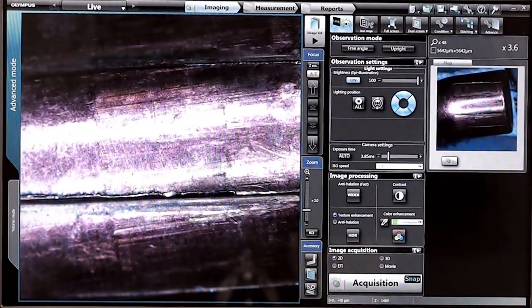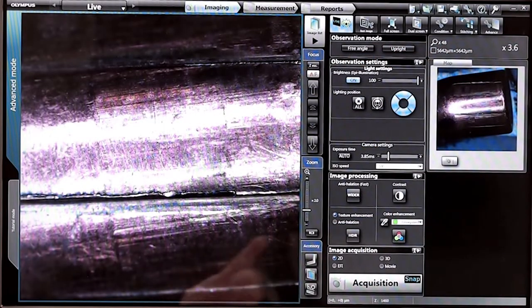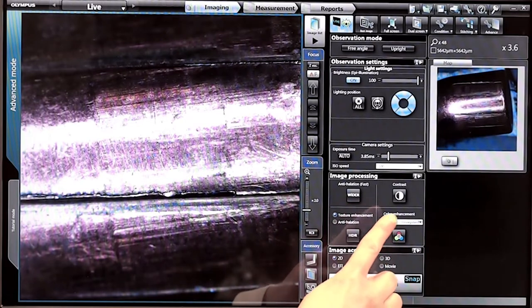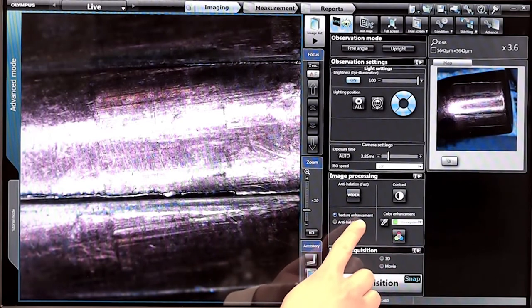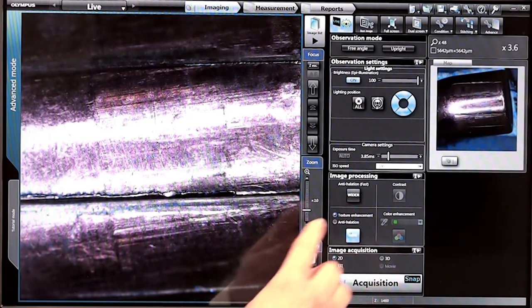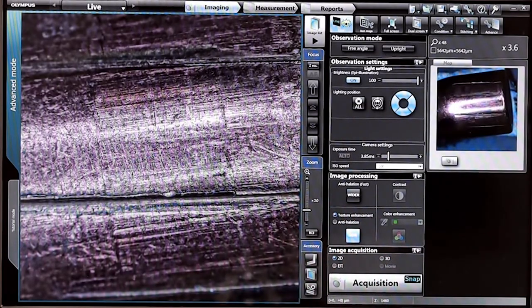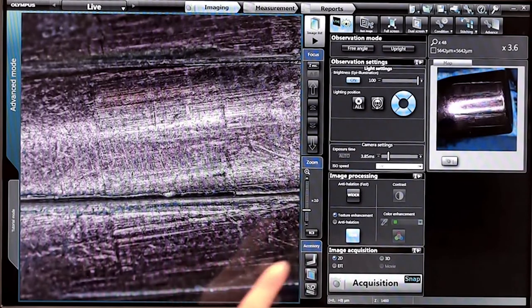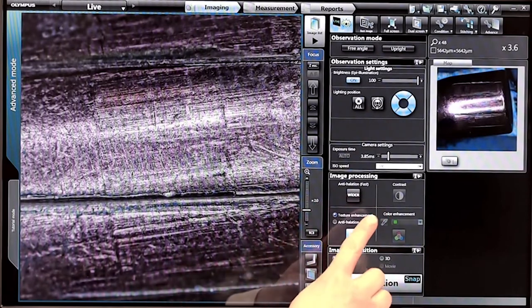High dynamic range imaging blends several exposures into a single image with extra clarity to give captured images the extra edge required for critical assessment and measurement.